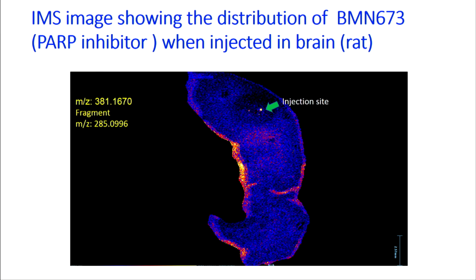into the area of the brain, and then when you couple this along with the histology, you can see exactly what molecules you are targeting. So, again, I really apologize that you cannot see this, but if you look at this structure in here, you can see the distribution of the drug throughout the rat brain.